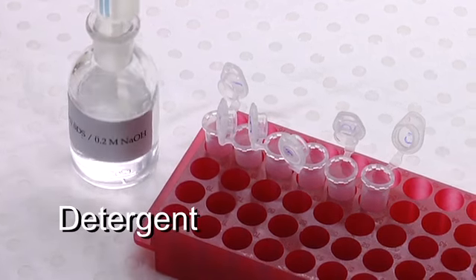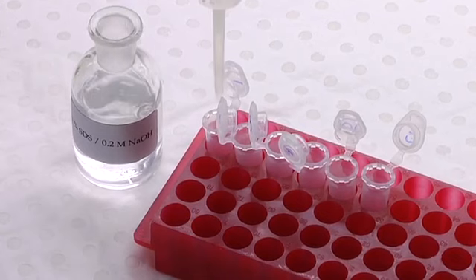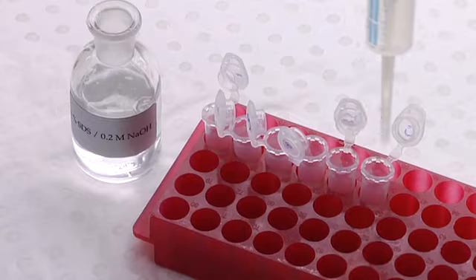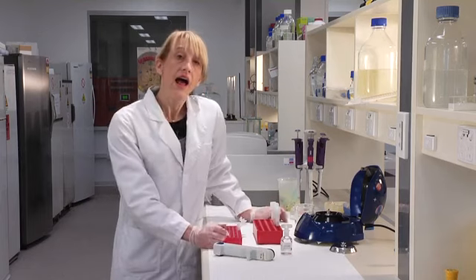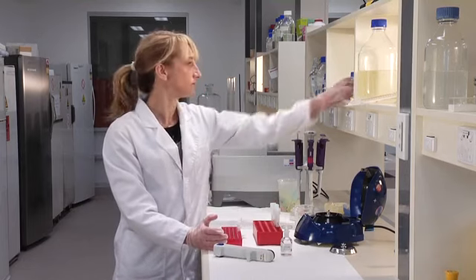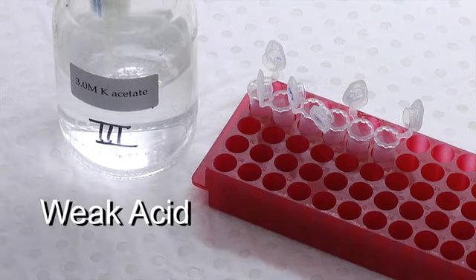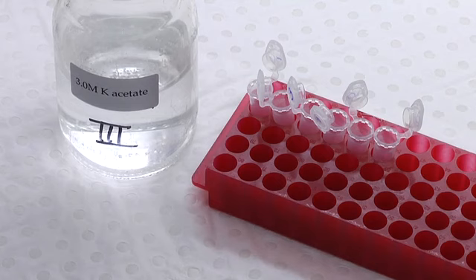And the next thing we need to do is break open the cells. And we do that using detergent at a high pH. The detergent breaks down the lipid cell wall to release the cell contents. And then we need to neutralize our solution. So we'll do that with a weak acid, like acetic acid.